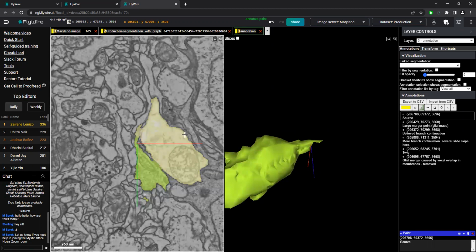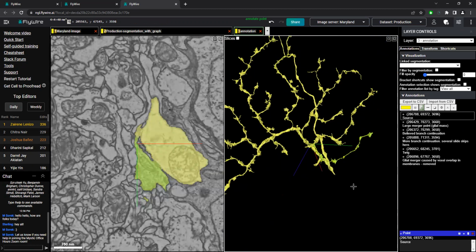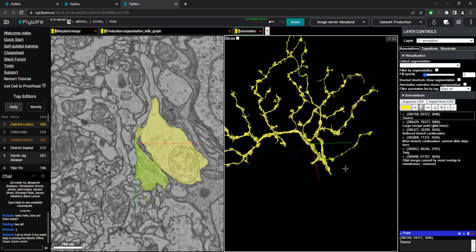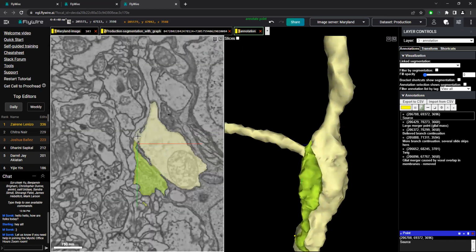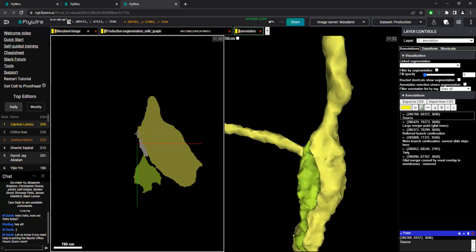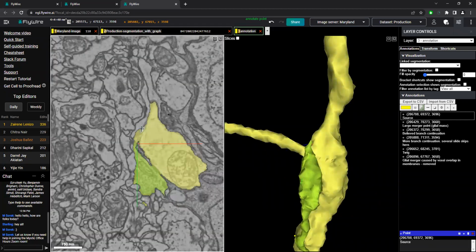Let's click it and see what happens. That brings up this big old cell that we definitely know our branch doesn't belong to. It doesn't look similar. We see the structure, and it certainly doesn't go. But it does have this little nublet part that I'm highlighting that seems to belong to what we want. So we're going to select where that continuation might be.